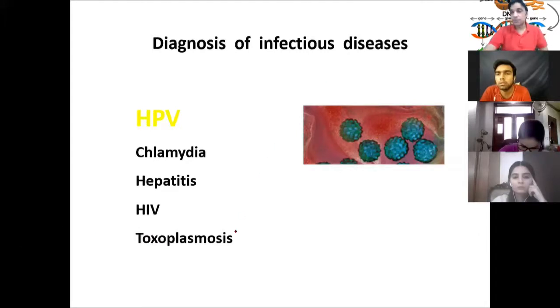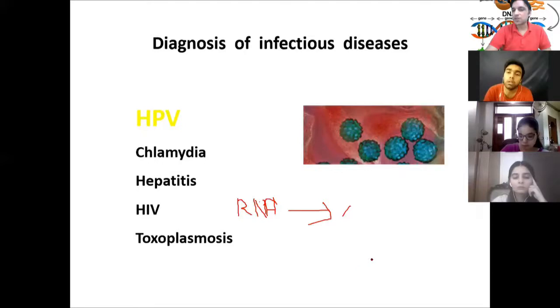is there, scientists should be able to get the RNA out of it. And coronavirus is an RNA virus. That means you should be able to get or extract the RNA out of that cotton swab. Once you extract the RNA, it is converted into cDNA. Once you have the cDNA, the game is simple and easy.